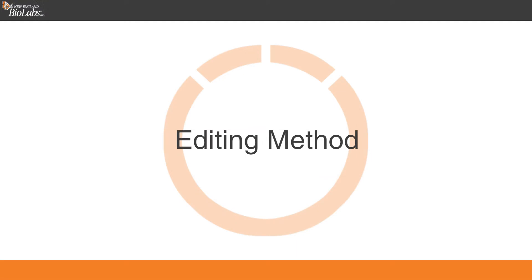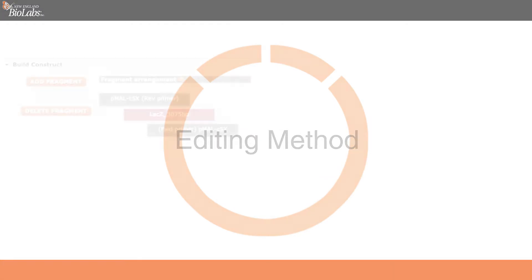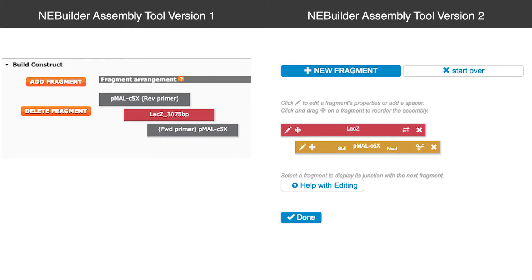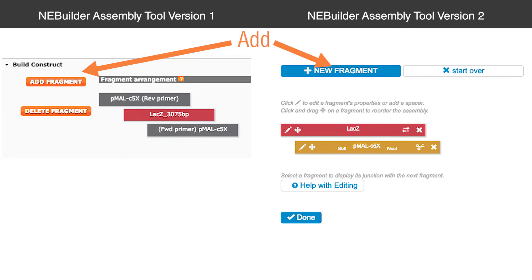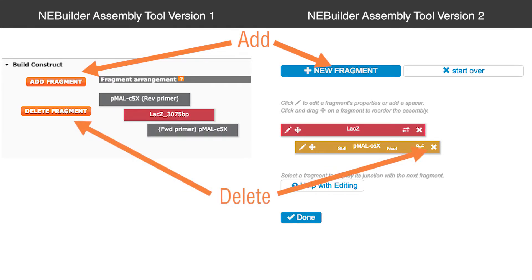Editing method. Finally, editing methods are slightly different in AnyBuilder version 2. Adding new fragments is basically unchanged — click the appropriate button, add fragment versus new fragment. To delete in version 2, simply click on the X at the right end of the fragment and confirm.